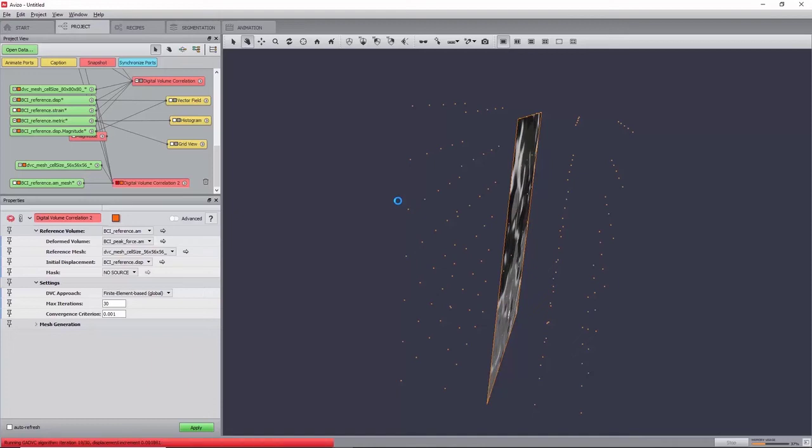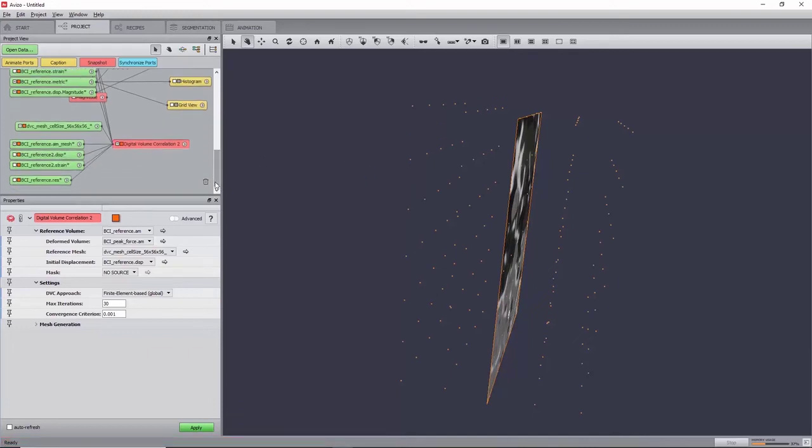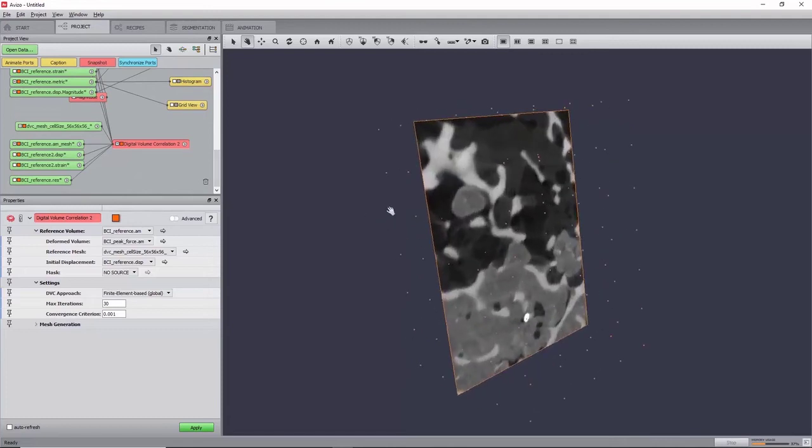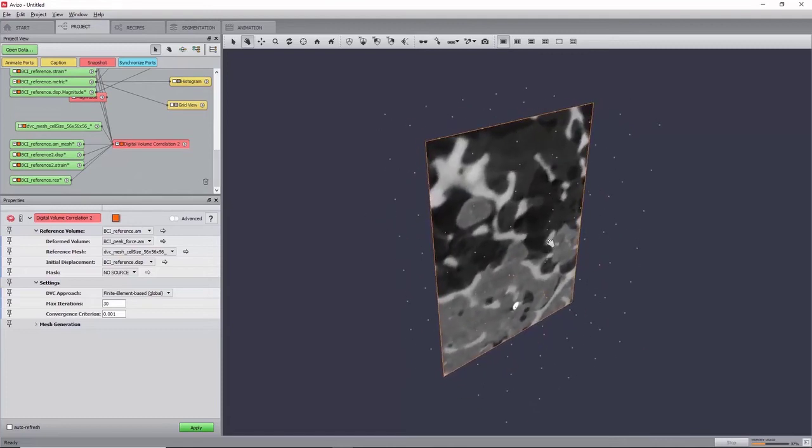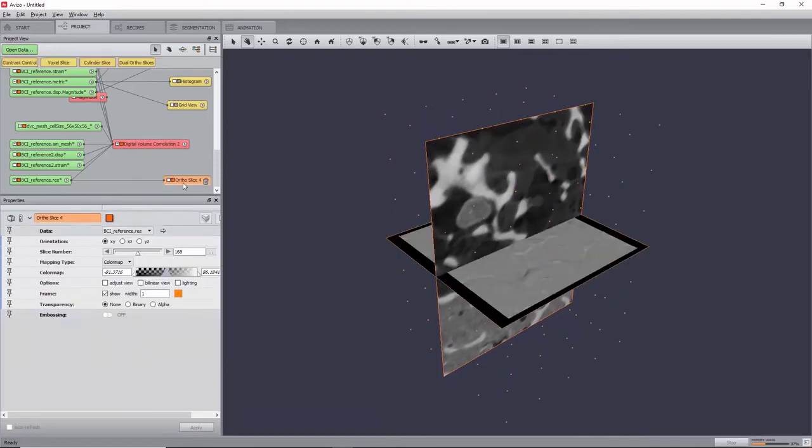Which corresponds to the difference between the reference image and the deformed image corrected by the computed displacement field. To check the quality of the correlation, create an autoslice on the residual image, bci-reference.res.